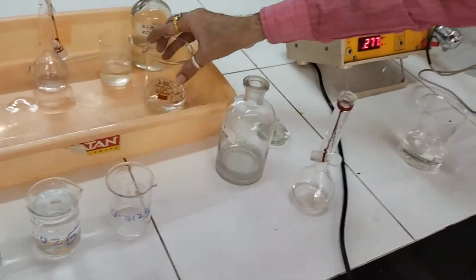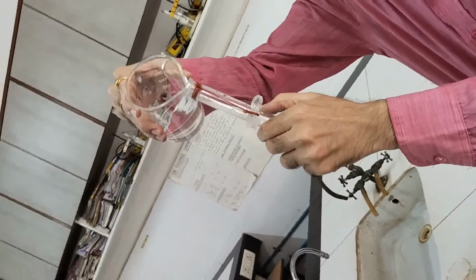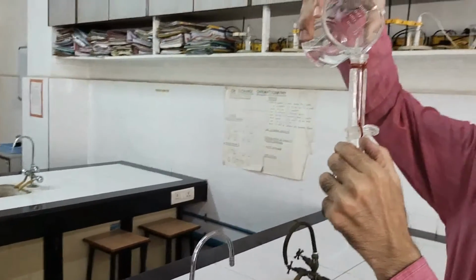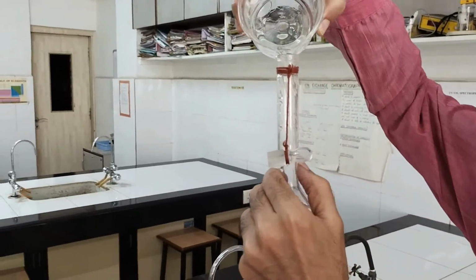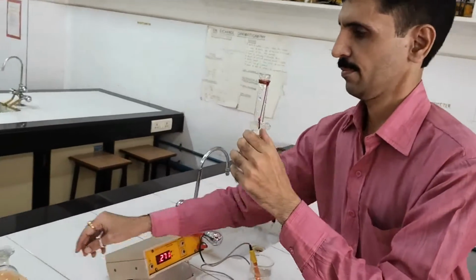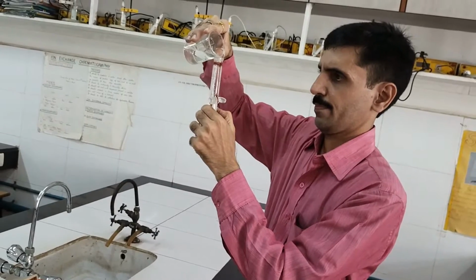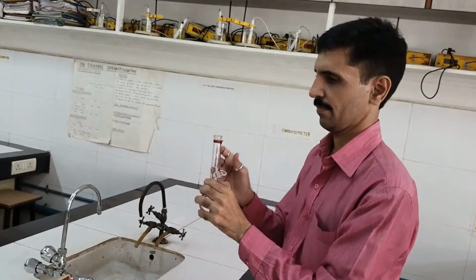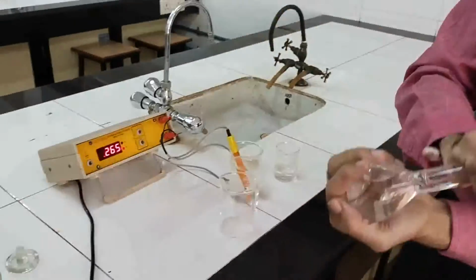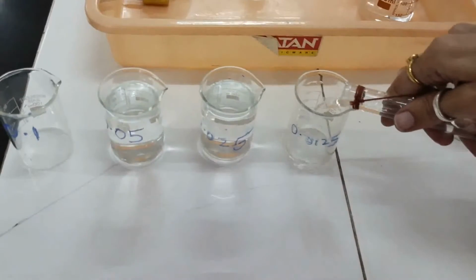So the concentration will become 1/8, and therefore 0.1, if you divide it by 8, is going to give you 0.0125. So we are going for the final dilution. Still requires some more amount of water. So as I said, this is going to be 0.0125 normal acetic acid. So I am going to transfer it into the respective beaker.